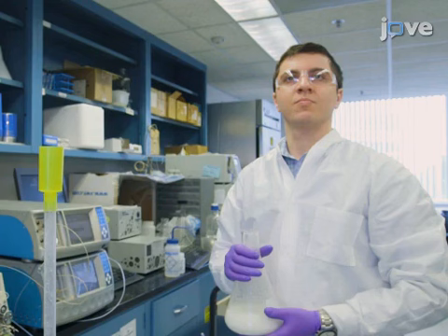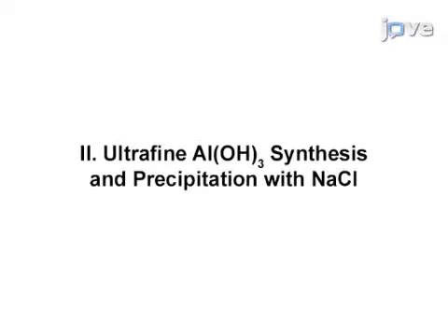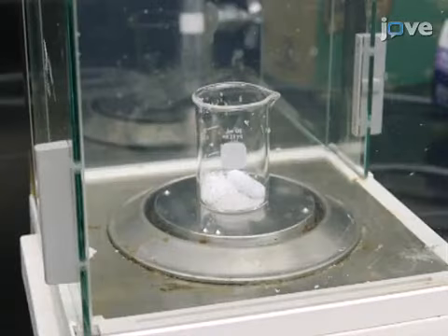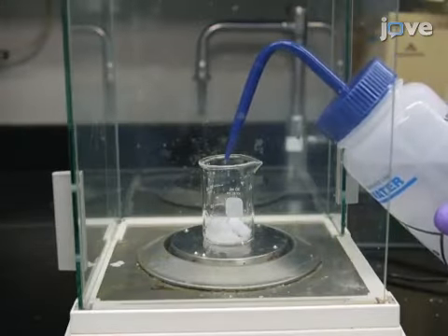Demonstrating the procedure will be our intern. To begin this procedure, dissolve 1.4 grams of aluminum chloride hexahydrate in 5.822 grams of deionized water.